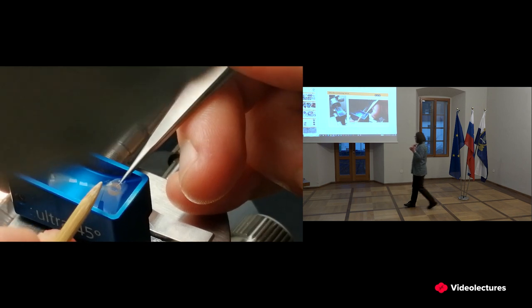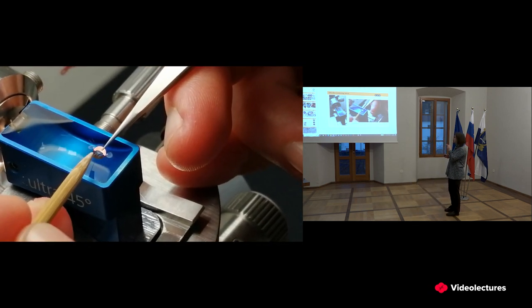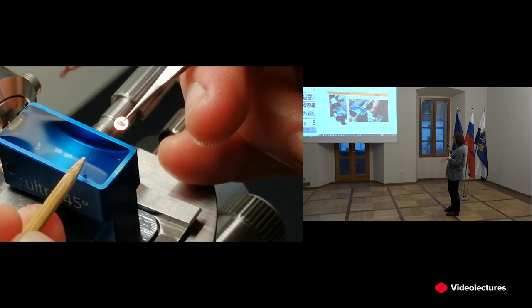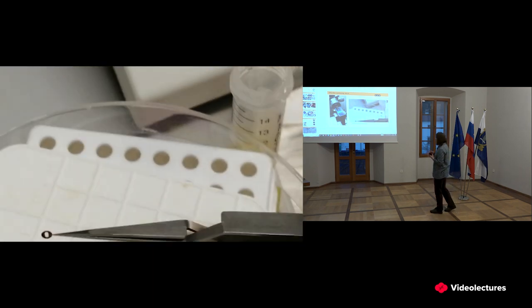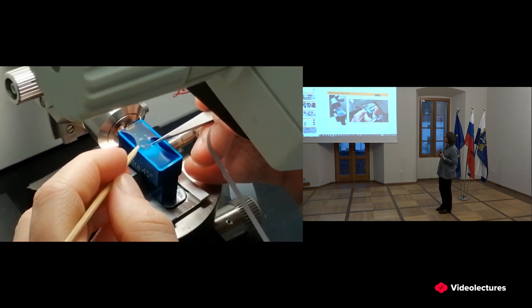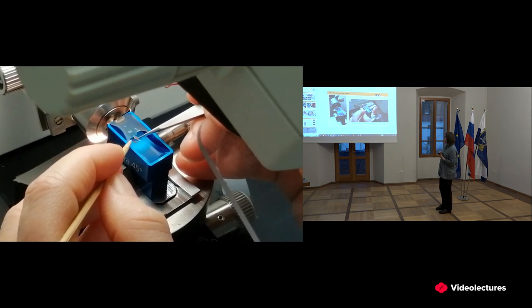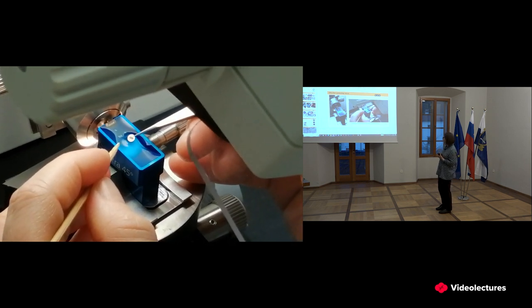So we don't take them directly. I have an eyelash attached to a wooden stick. I have to push it on the grid, which is covered with a plastic film, and then I slide it out of the water. Then it has to dry. So this really takes a little bit of practice. It's not something that students can learn in a week. Usually it does take a year, and there's always something to do better, learn more.